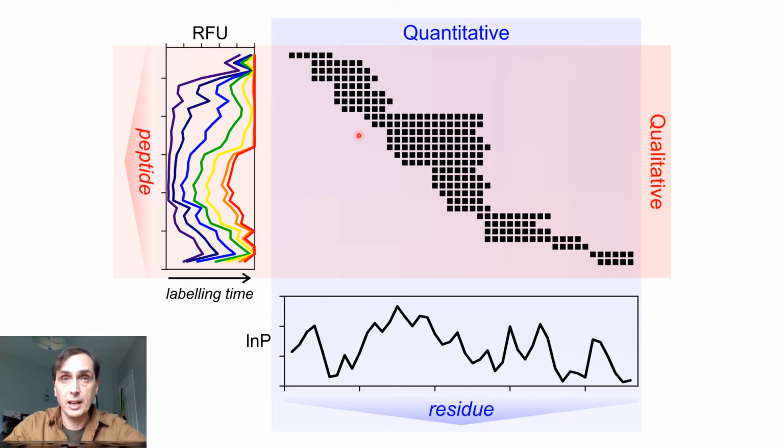So in this hypothetical peptide map here, normally when we're using HDXMS, we're characterizing exchange along the y-axis, and so we end up with an output which can show the change in mass, or RFU, which is relative fractional uptake, of each peptide over a range of different labeling times or isotope exposure times.